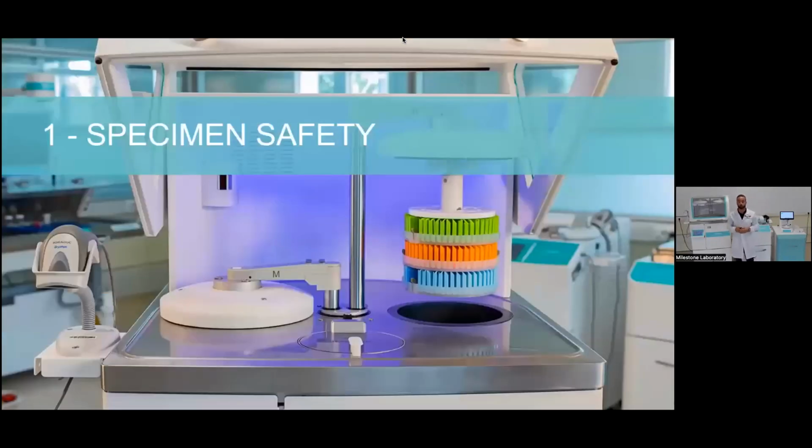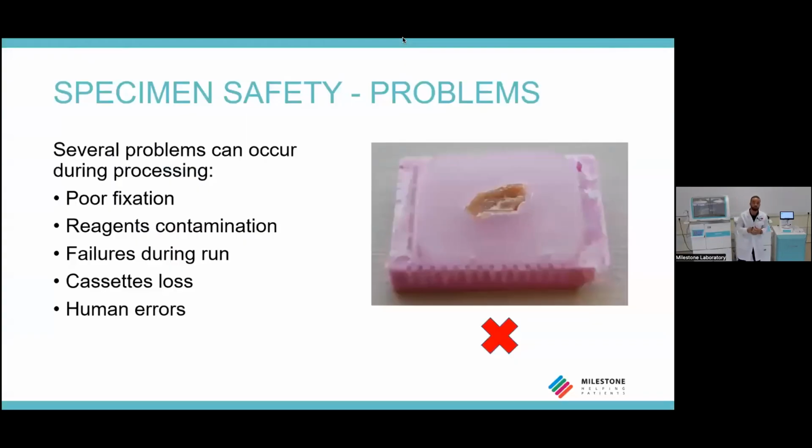The first area of interest that we are going to deal with is the safety of the specimen. In order to have a precise diagnosis, all tissue must be managed in a safe way, paying attention to all processing steps in order not to ruin or damage it. In fact, as is well known, errors and critical issues are always around the corner. So which are those troubles? We have grouped them in the following list.